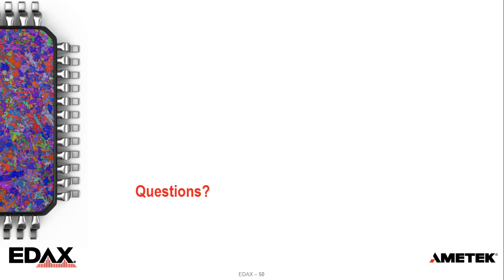I'll take the first one here. There's a question asking, would cryo-cooling help to avoid beam damage of perovskites during analysis? I think the answer is yes, we think so, but we haven't validated that ourselves yet. But we have talked about that as a possibility.